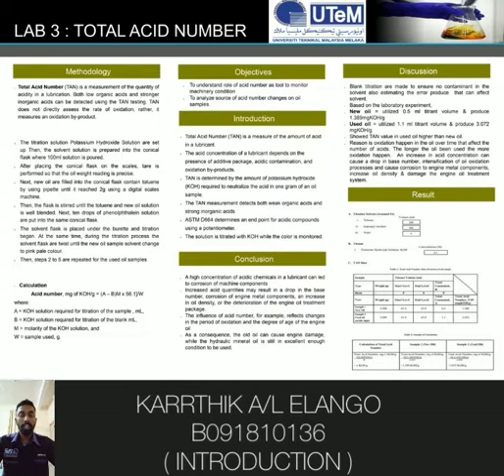Lubricating oils, especially engine oils, are exposed to high temperature under operating conditions. As a result of the combined effect of oxygen in the air and high temperature on the oil, it becomes oxidized. Due to the aging process, inert substances and acidic substances are formed, which cause corrosion and increased wear of metals. Among the acidic substances, engine oils may contain strong organic and inorganic acids.